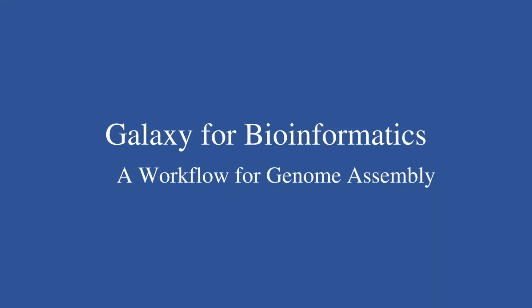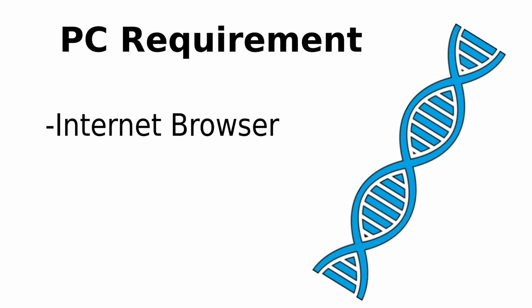In this video, we are going to look at how to develop a Galaxy workflow for genome assembly. All right, so for this tutorial, the only requirement is to have an internet browser, and of course, an internet connection. So I'll show you everything step by step.